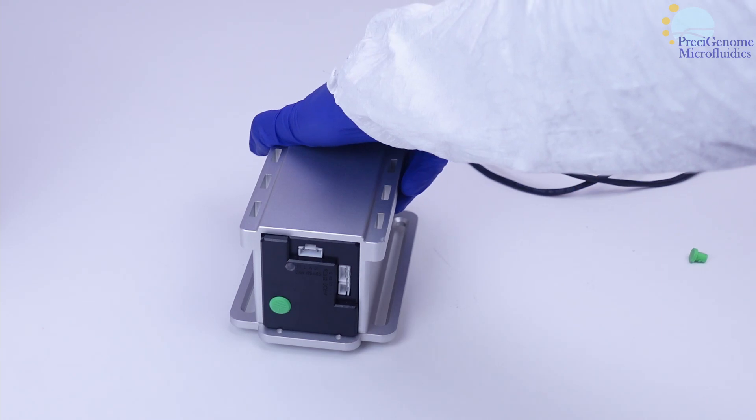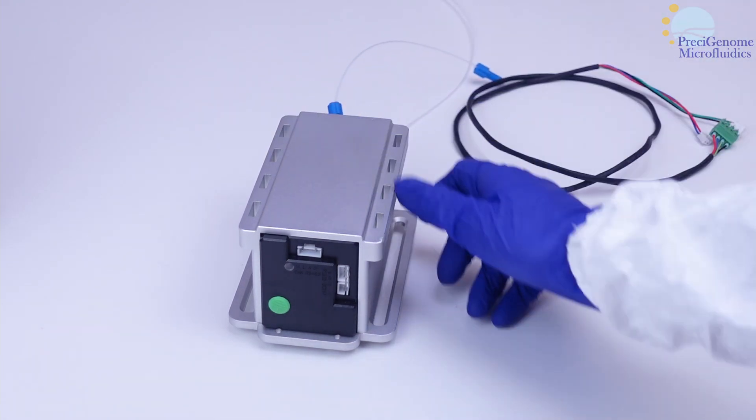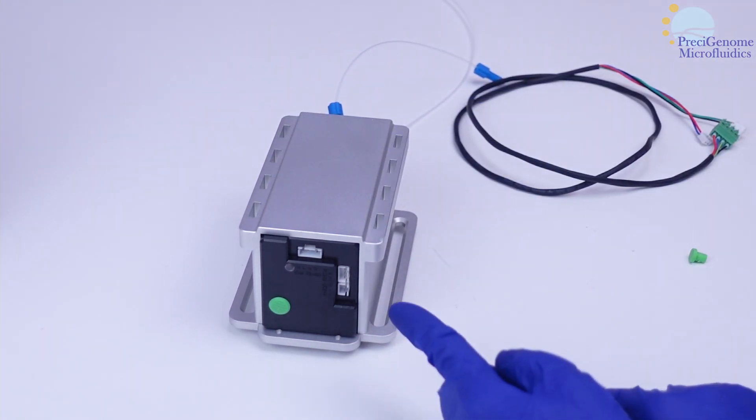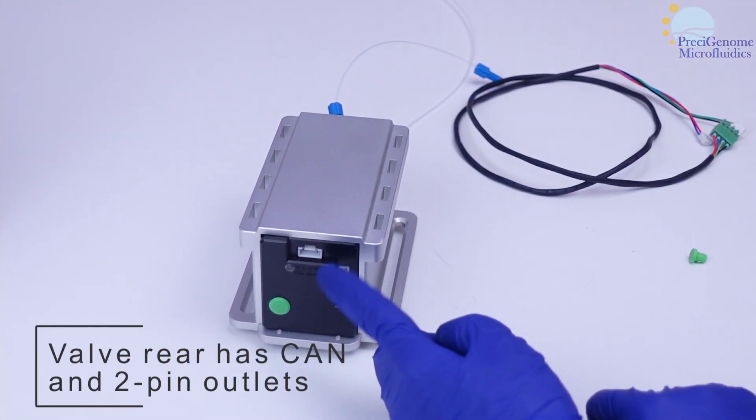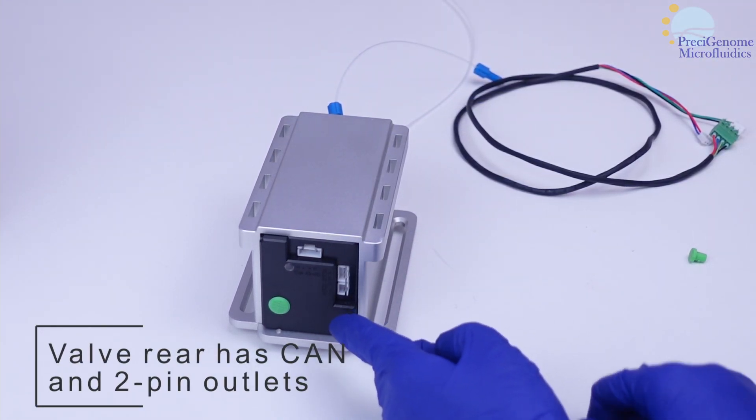The rear of the valve has a can and two-pin outlet which we'll need to power it on.